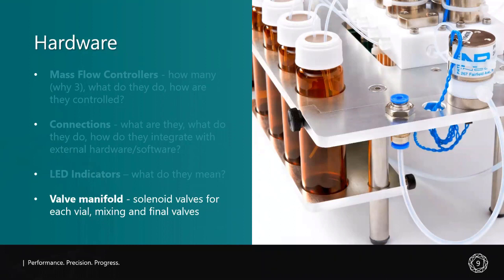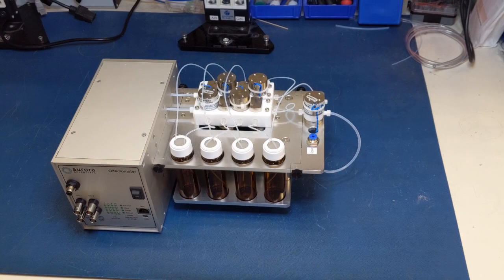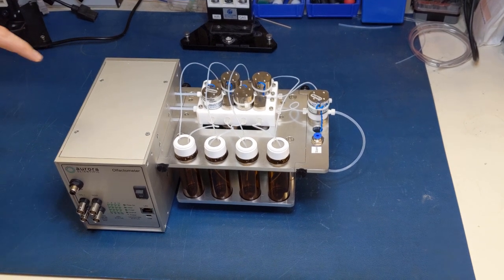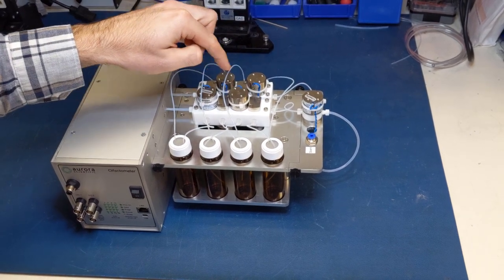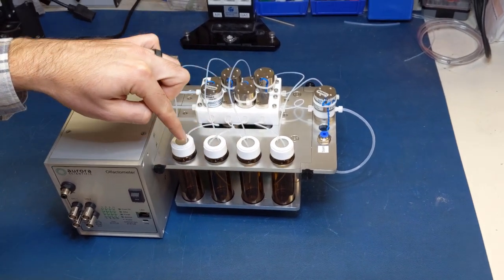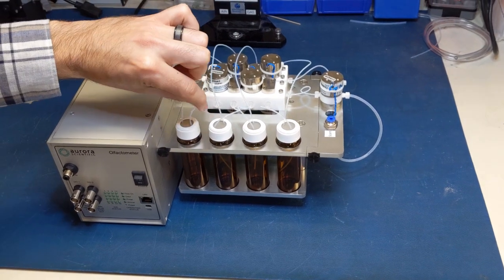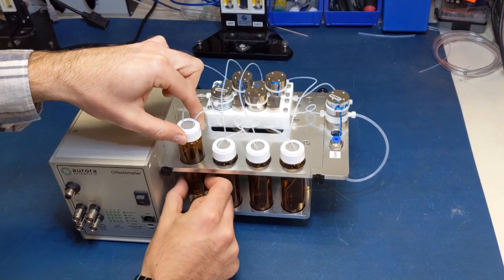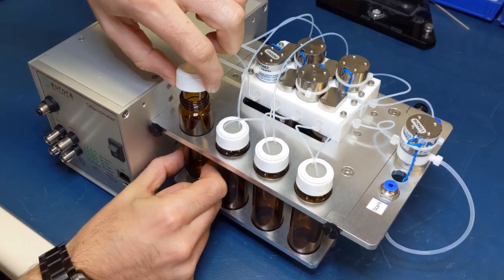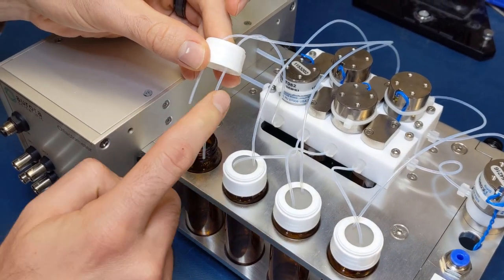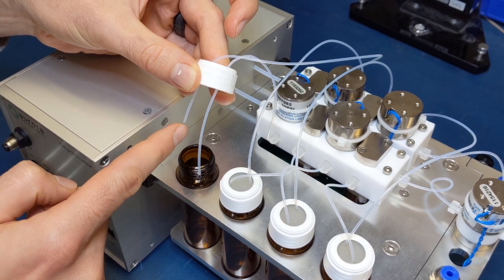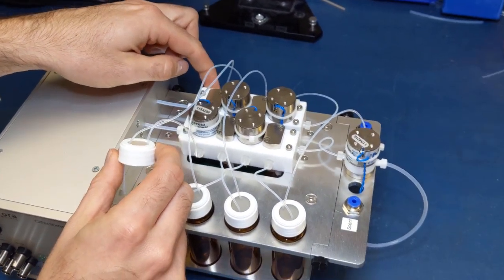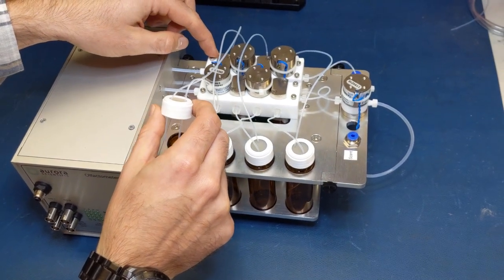Moving away from the control box and into the valve manifold, let's take a look at the solenoid valves, what role they play in the system, and where they are located. From the odor MFC, air flows into the vial manifold to 4 solenoid valves, each one corresponding to a single vial in the order in which they are mounted: 1, 2, 3, 4. When the vial valve opens, air flows into the vial containing the odorant. The air flows down the longer tube, which generates headspace within the vial. The shorter tube then picks up the odorant created in this headspace. Once the odorant is picked up, it travels into the dilution flow and then finally down to the mixing valve.